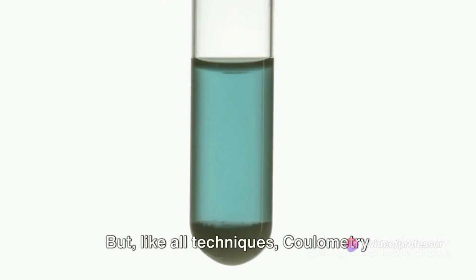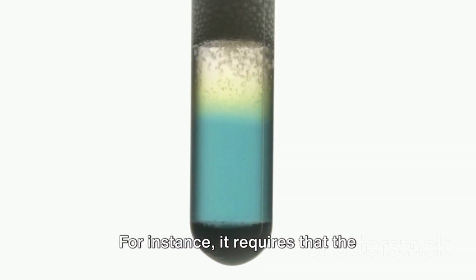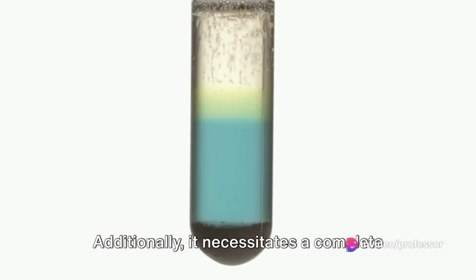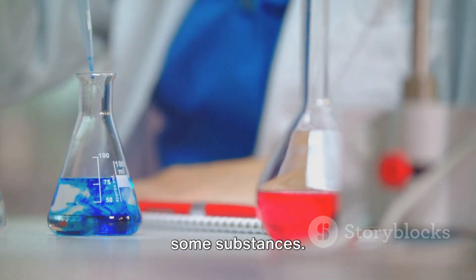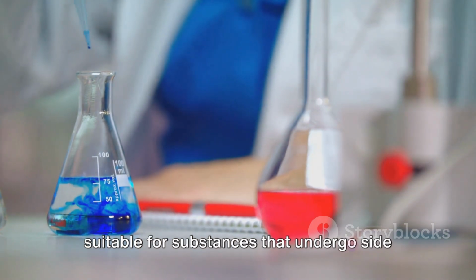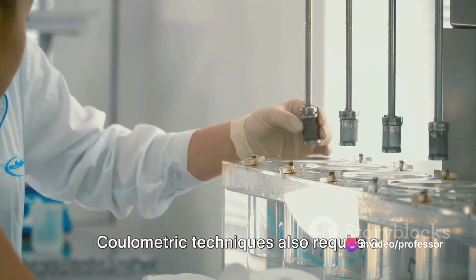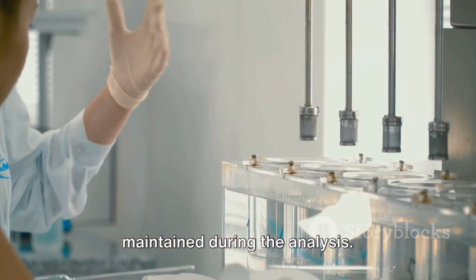But, like all techniques, coulometry isn't without its limitations. For instance, it requires that the substance being analyzed is electroactive and that its reaction at the electrode is known. Additionally, it necessitates a complete reaction, which can be a challenge for some substances. Furthermore, the technique may not be suitable for substances that undergo side reactions, as this can interfere with the accuracy of the results.